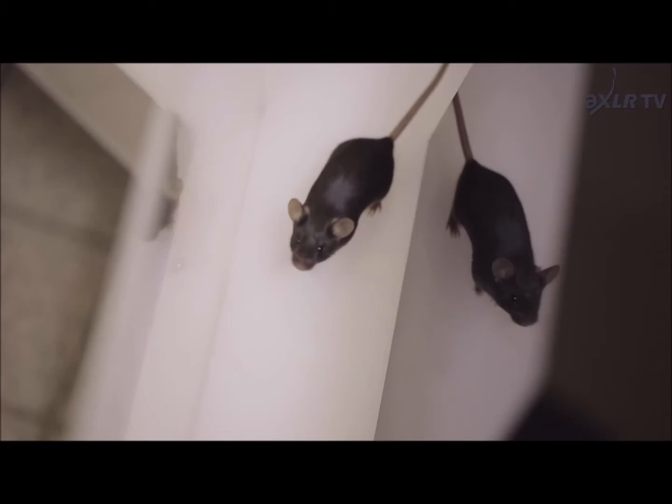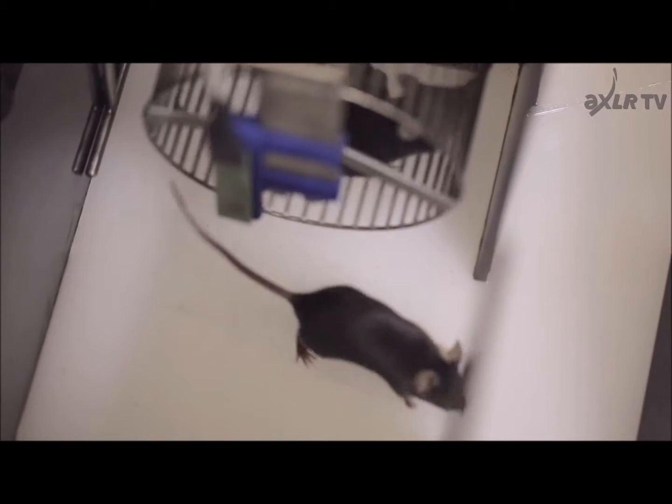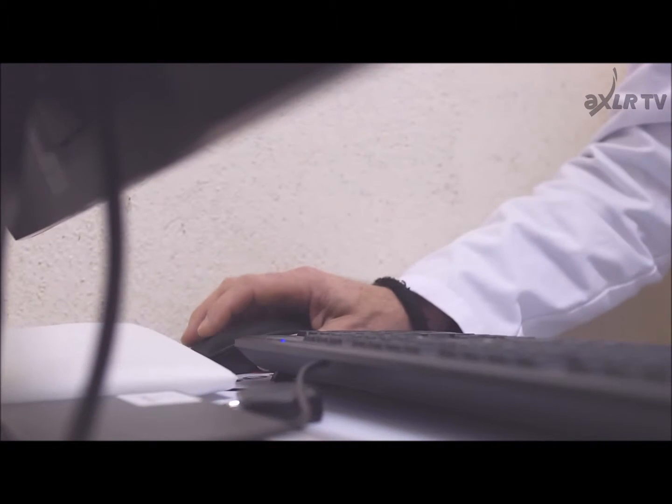In this test, the protocol we use is we habituate animals four hours per day during two weeks. After two weeks, we can measure topographical memory by checking the ability of the animals to go individually to the drink house. We take out the bottle one day after and measure the exploration of the animals in the maze.